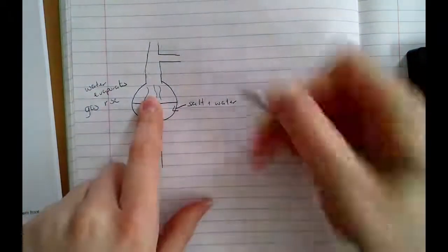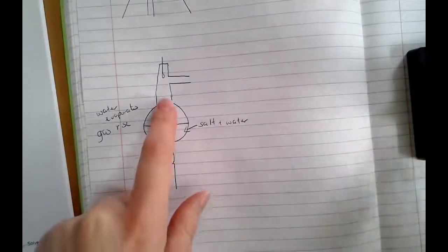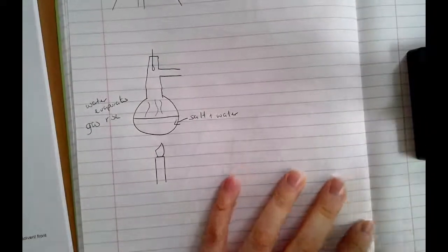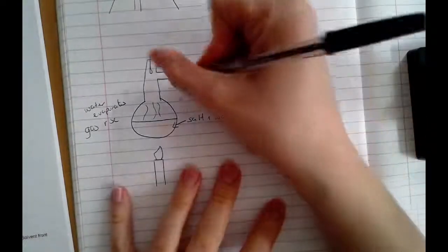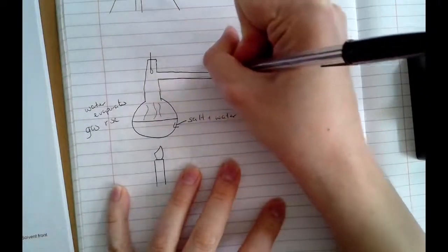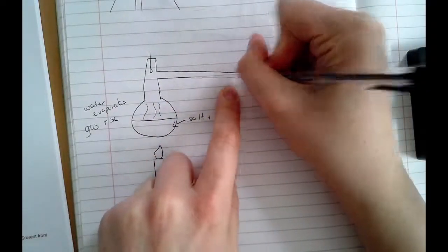I'm going to put a thermometer in here. Rather than having just an open container where all the gas can escape, we are going to trap that hot gas. And we're going to cool it back down so that it becomes a liquid again. To cool a gas back to a liquid is called condensing. And we use a condenser in order to do it. The condenser is just, I'm going to draw it as like this tube. And you need the condenser to be really, really cold. If it's not cold, then this isn't going to work.